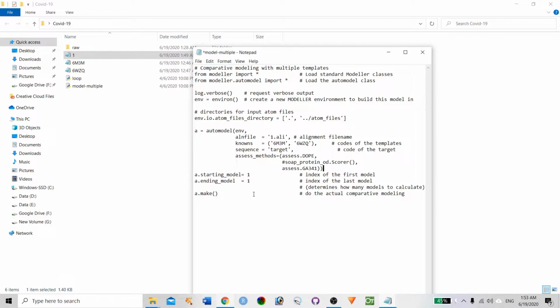After that, how many models, how many conformations do you want? Do you want only one protein model or multiple conformations? It is always better to select multiple conformations. Why? We don't know in which conformation we are going to get a highly good or well characterized homology model. So I'm going to generate up to 100 protein structures.